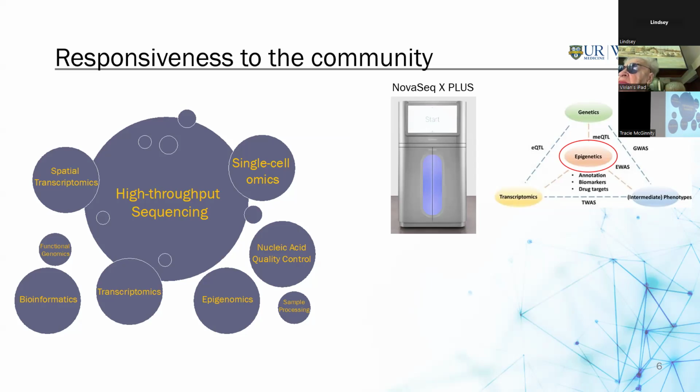So it's not linear, but it gives you perspective that now, if you're interested in doing cohort analysis or genome-wide association studies or doing things on a bigger scale, sample size is important. You now can achieve a sample size without breaking the bank, right? And that's really important. And most importantly, we are the only institution that has this in the region. The next closest is Pennsylvania. Roswell Park does not have one. Very few people in New York City have one.